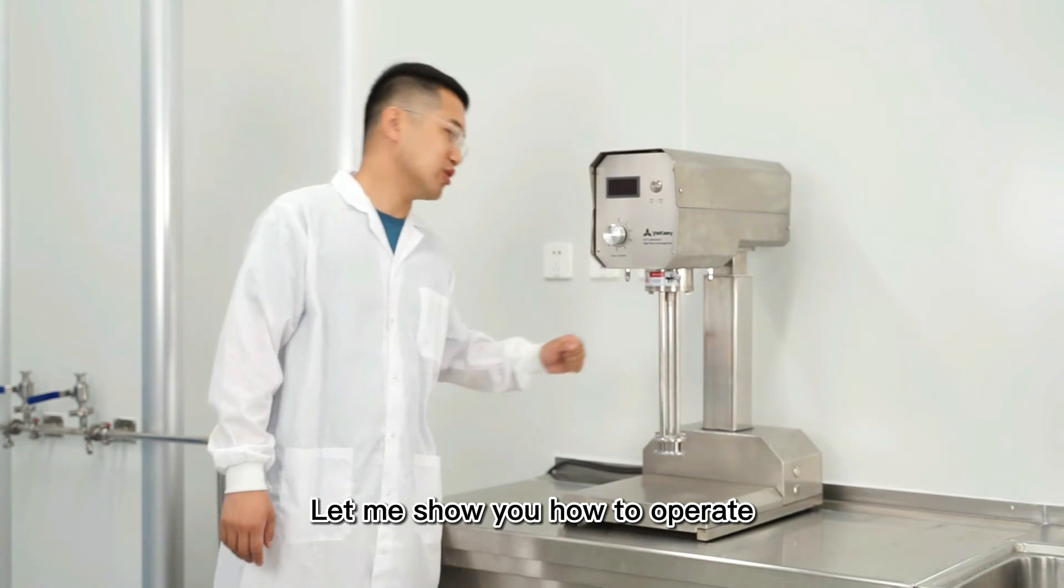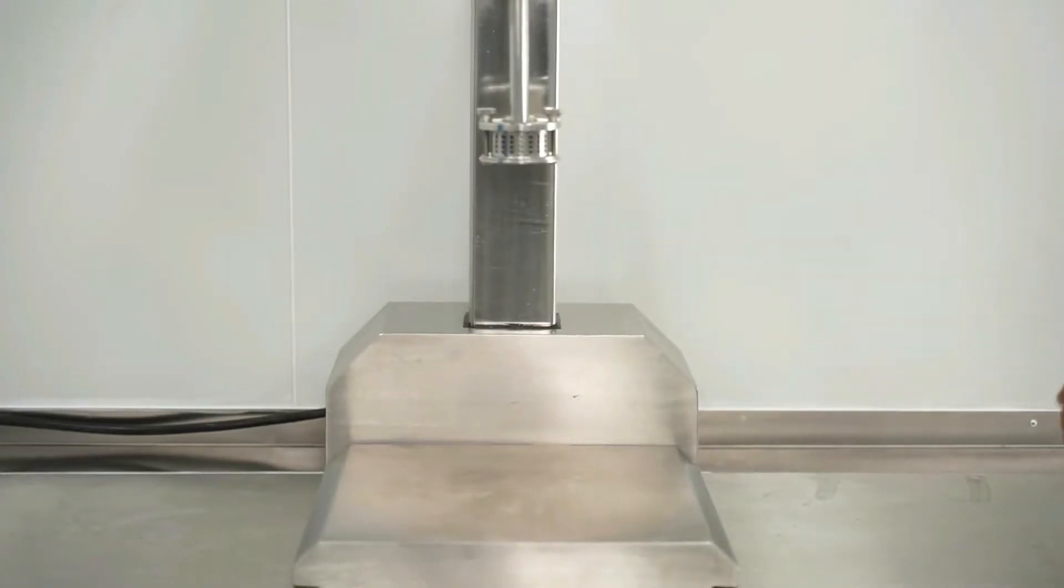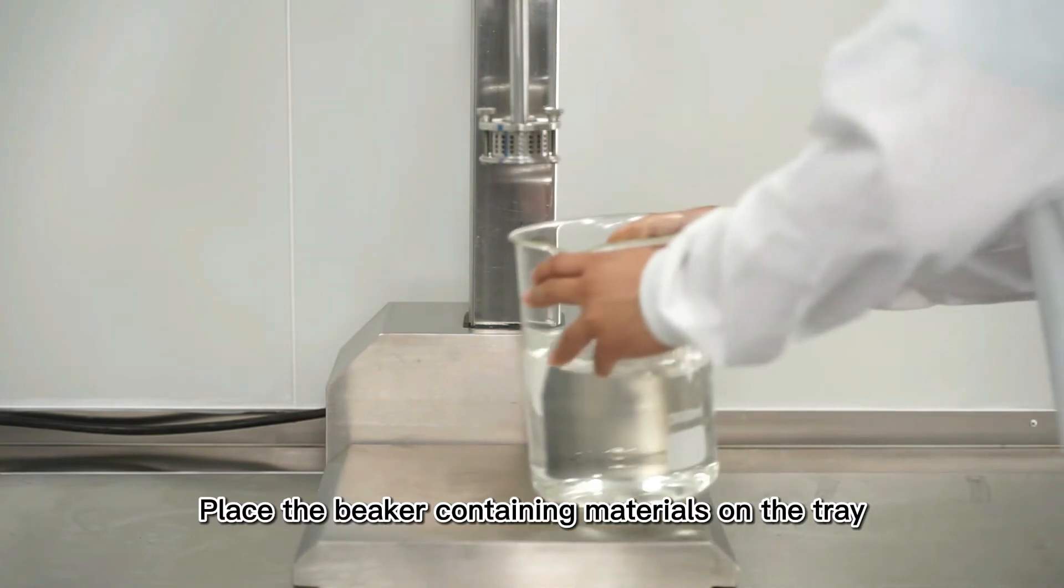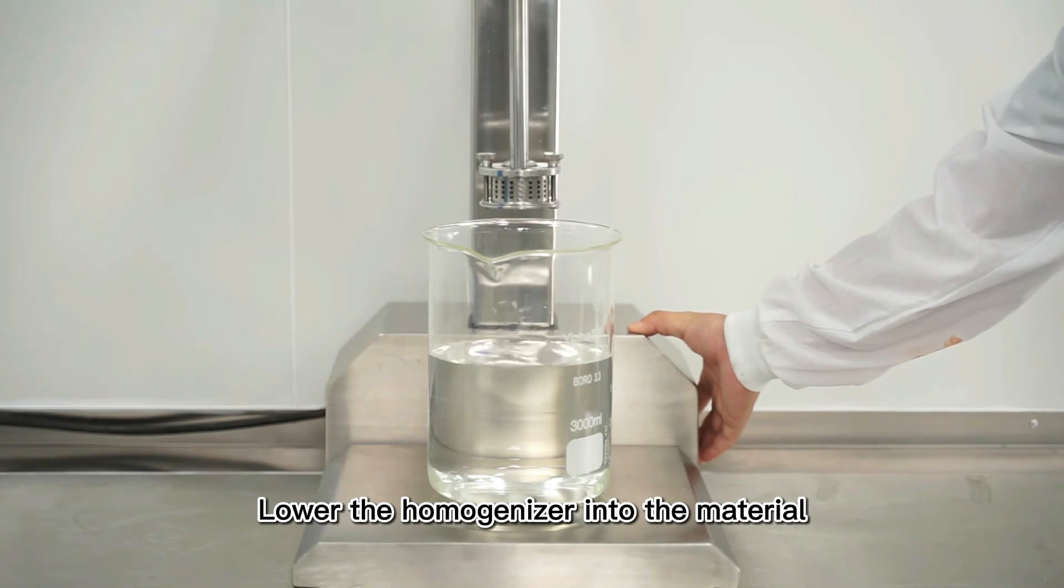Let me show you how to operate. Place the beaker containing materials on the tray, then lower the homogenizer into the material.